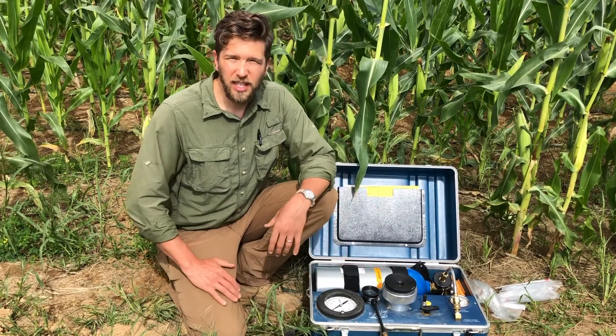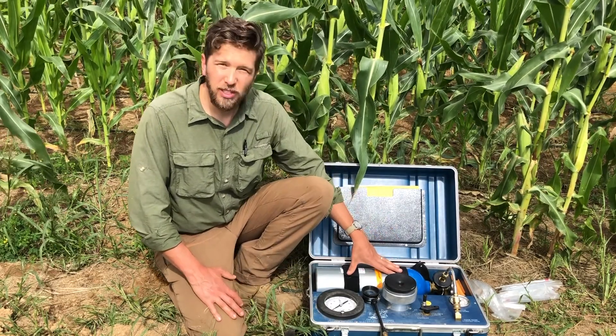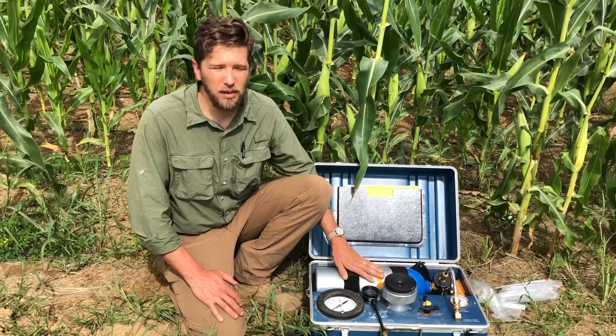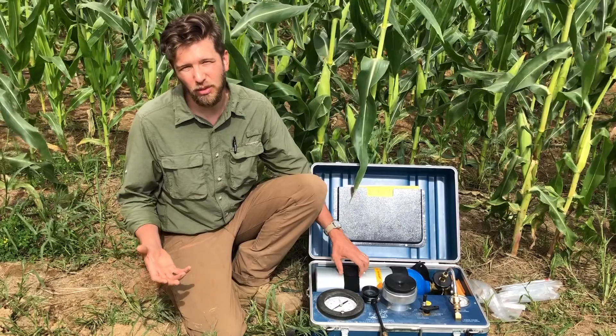To help us understand the degree of stress that plants are experiencing in our drought trials, we utilize this tool here, which is known as a pressure bomb or a Scholander bomb. To understand how this device works, you need to understand something about how water is transported through plants.